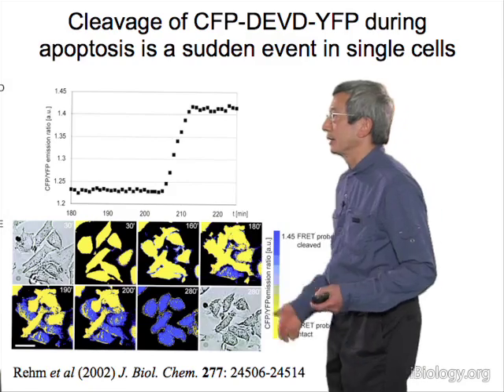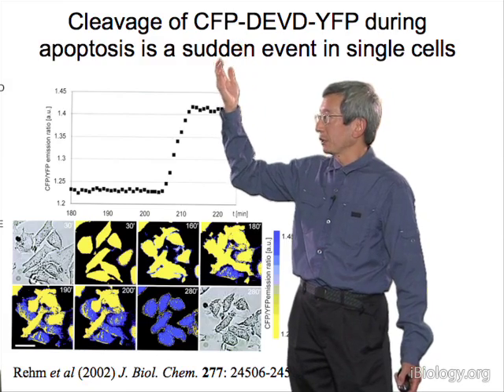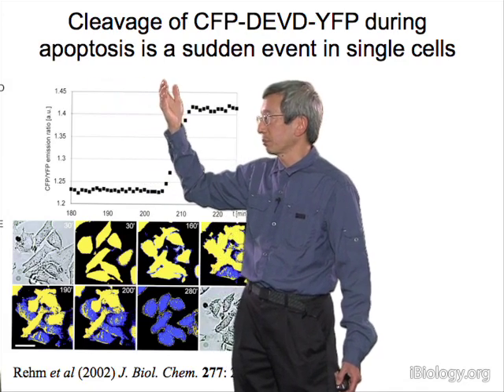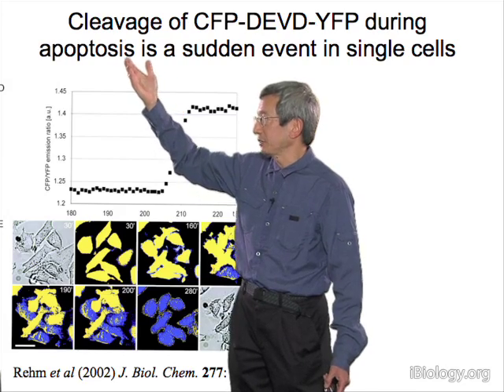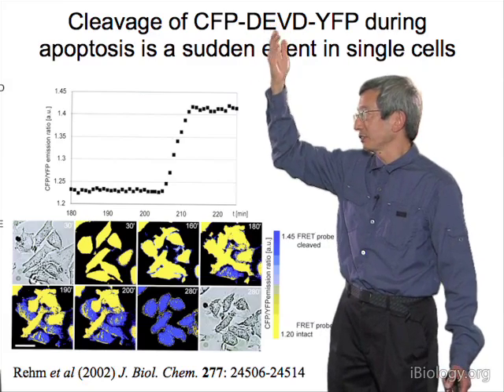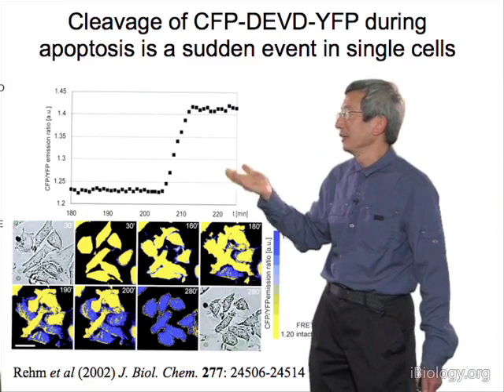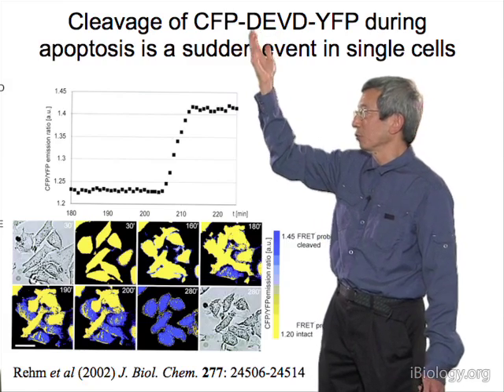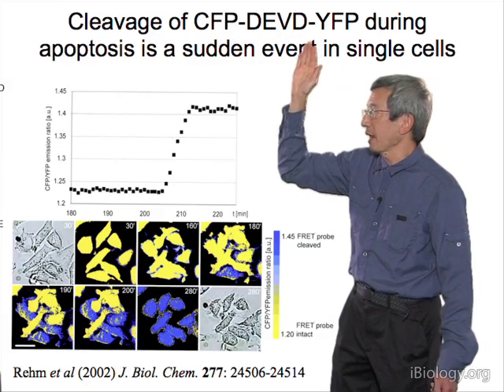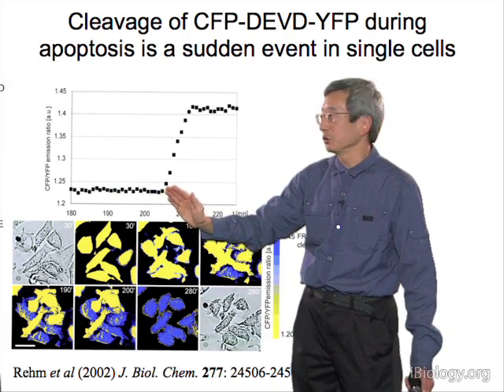So here are some biological examples. This is the protease sensor for apoptosis, and you know that in apoptosis there's the massive activation of a whole sequence of proteases, including the famous caspases, and they like to cut the sequence DEVD. That's their favorite substrate, known from other biochemistry. This isn't all there is, but basically this is the crucial bit of the substrate, and we put that between CFP and YFP. We get strong FRET beforehand, and in this particular case, cells were induced to apoptose.